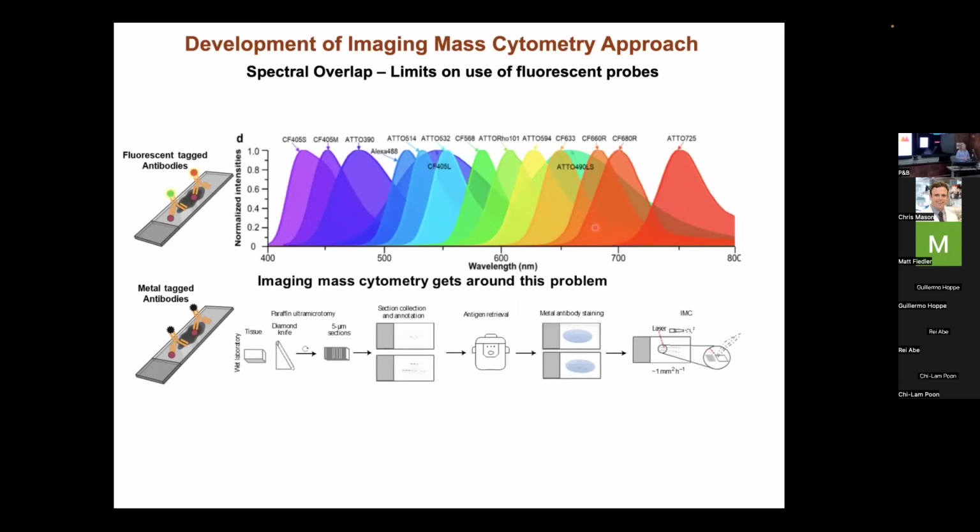The other thing is that if you imagine you lose pretty much half your fluorescent spectrum because of autofluorescence, you really are limited in the number of antibodies you can use due to the issue known as spectral overlap. The thing is that even with multi-parameter spectral flow cytometry and imaging, you're still going to be limited to 5-7 antibodies. It's not like you can throw in 40 antibodies at a time.